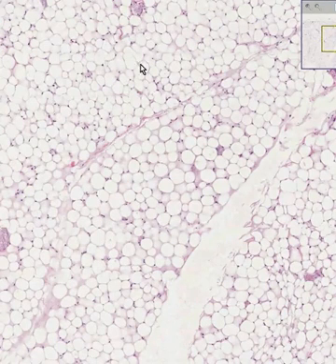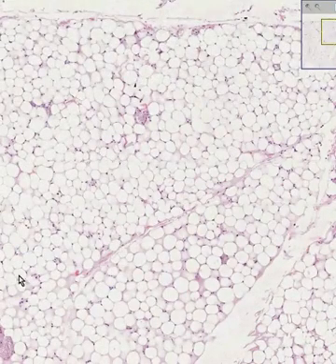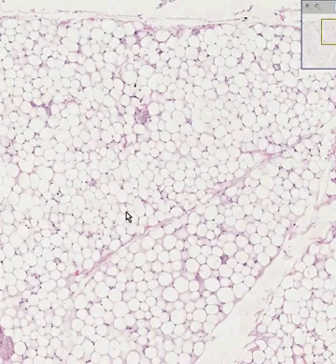Sometimes you'll see a little bit of fibrous connective tissue interspersed with it, like perhaps you see here or perhaps you see here. And often towards the edge of mature connective tissue, you tend to see a few little extra collagen fibers or fibroblasts as well. Let's zip up a little bit more and nail this thing down.